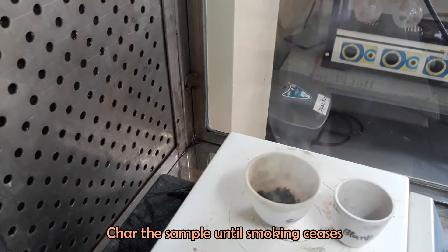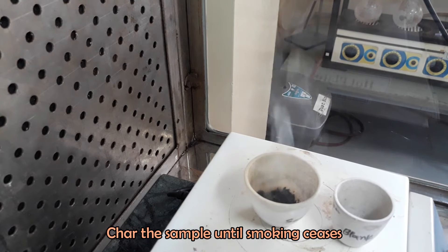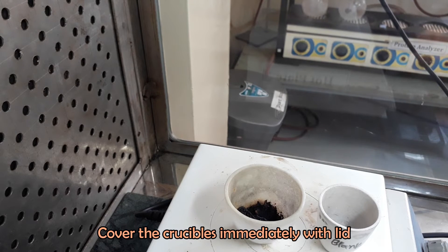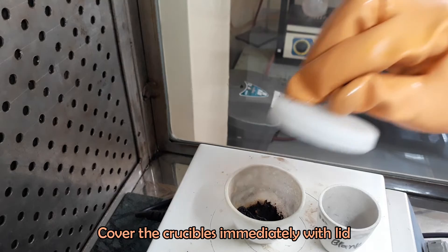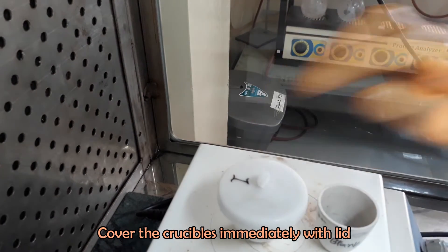Char the sample until smoking ceases. After 30 minutes of heating, black burning sample is seen from which no smoke is coming out. Cover crucibles immediately with lid.